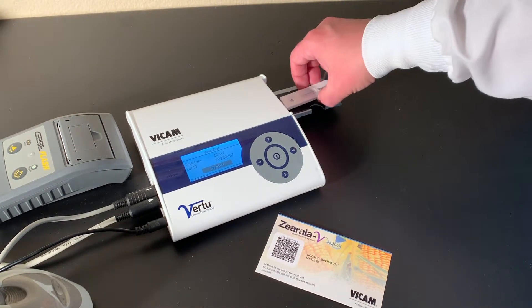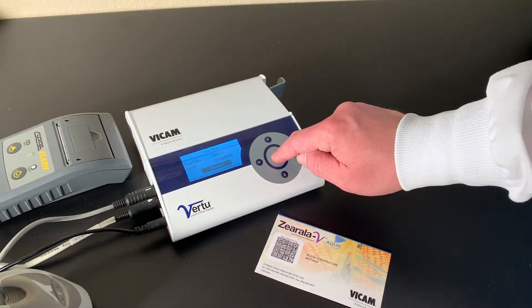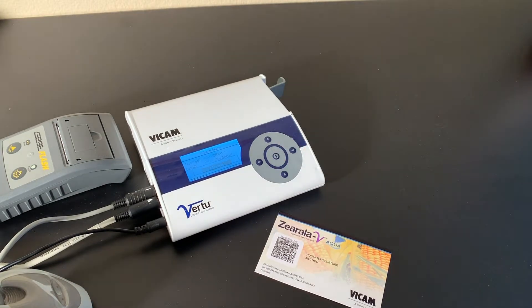Place the strip inside the Virtu reader, the round opening facing inwards. Press the center button. The results are shown on the screen.